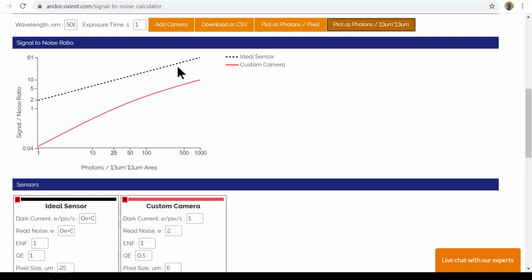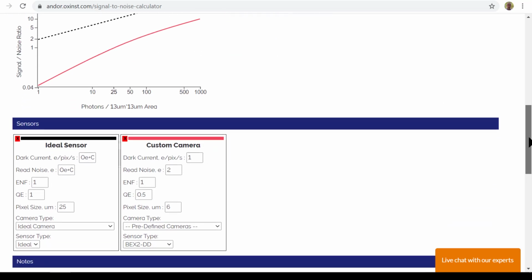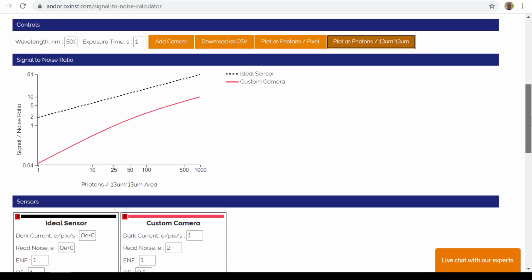What does that correspond to in real situations? Well, this is if you're just swapping the cameras. So you're sitting in front of a microscope with an image, and I look at camera number 1, I say, okay, looks cool, let me switch to camera number 2. I just pop the camera off, put another one on without changing anything about the optics or magnification. And I say, oh boy, this image looks much worse, but I haven't actually controlled for pixel size. So I'm spreading the same image over a greater number of pixels, and I'm slicing it up into finer pieces. So each individual piece has less signal inside of it.